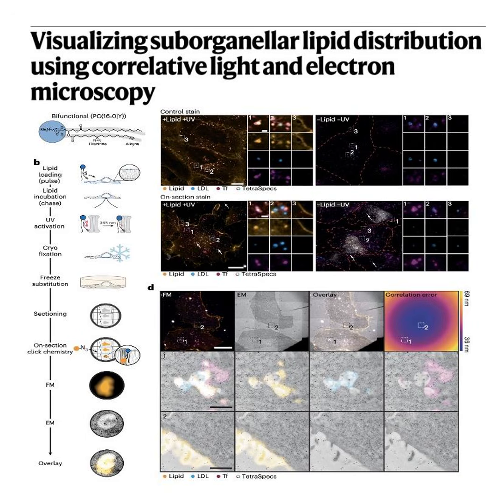Okay, so how does this new paper solve the glowing neon sombrero problem? Because they use something called a bifunctional diazirine alkyne lipid probe. Right. And let's anchor this to a specific one they used in the study, PC16:0Y. Okay, PC16:0Y. Break that chemistry down for me. Well, the chemistry is highly elegant. They just stripped that bulky fluorescent tag off completely.